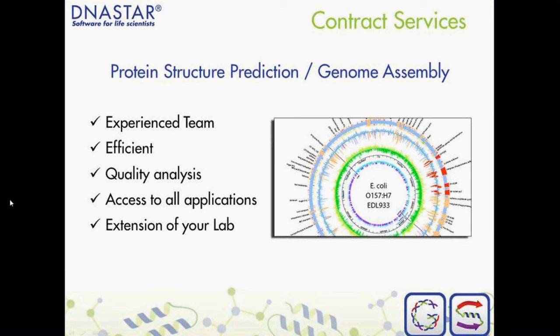So at this time, I'm going to move out of the presentation and give a live demonstration of our structure prediction tools. Before we get into the software demo, though, I'd like to open it up to any questions that have come in. Yeah, thanks, Katie. We've actually had a few questions come in so far.